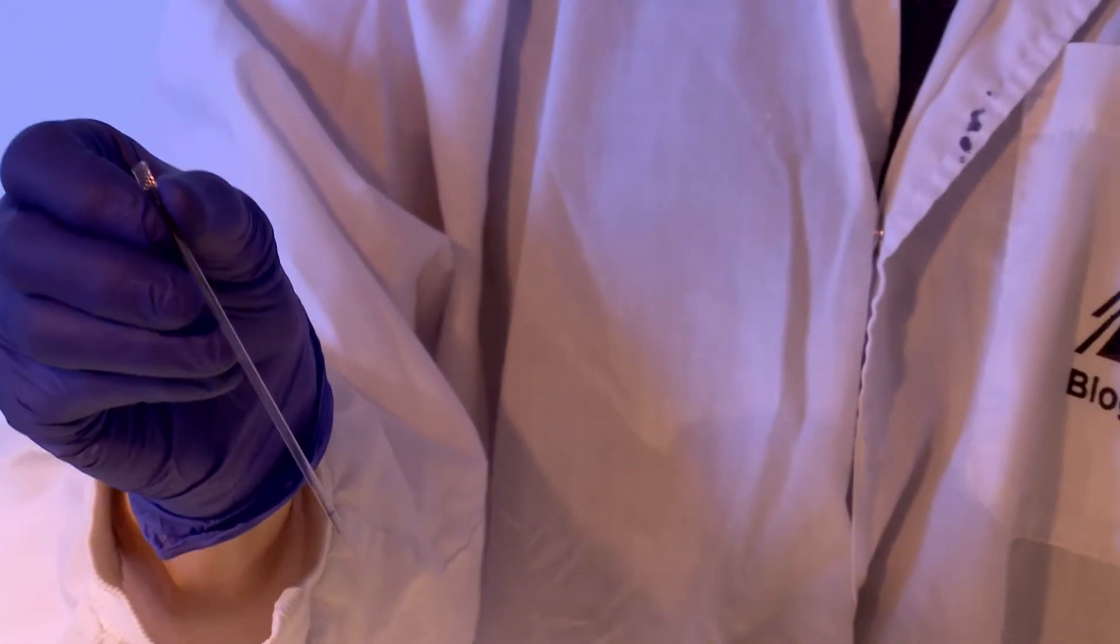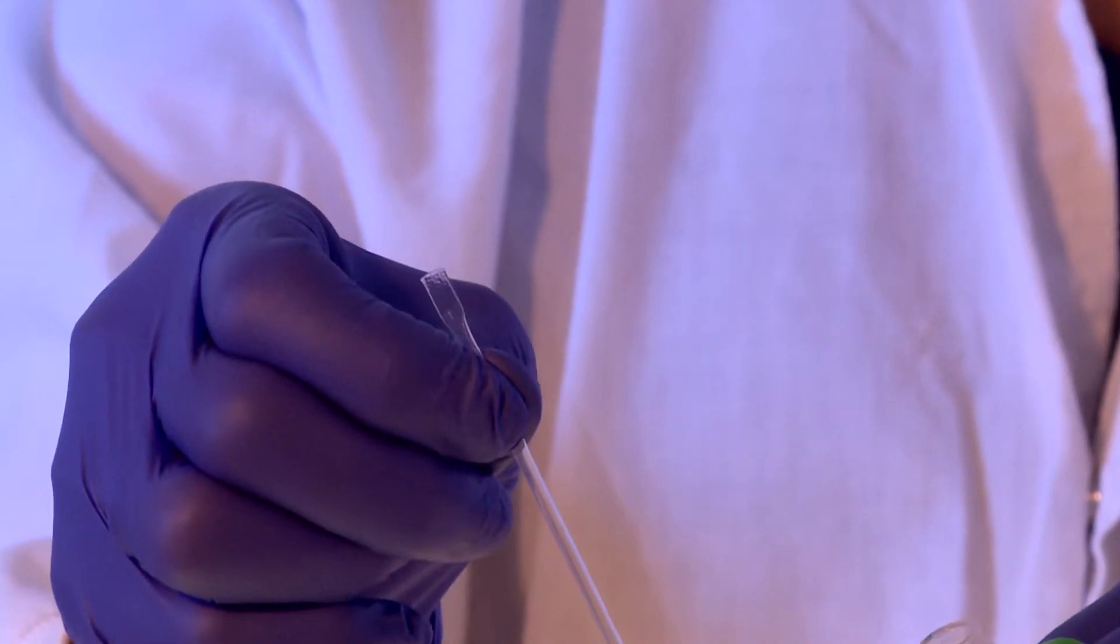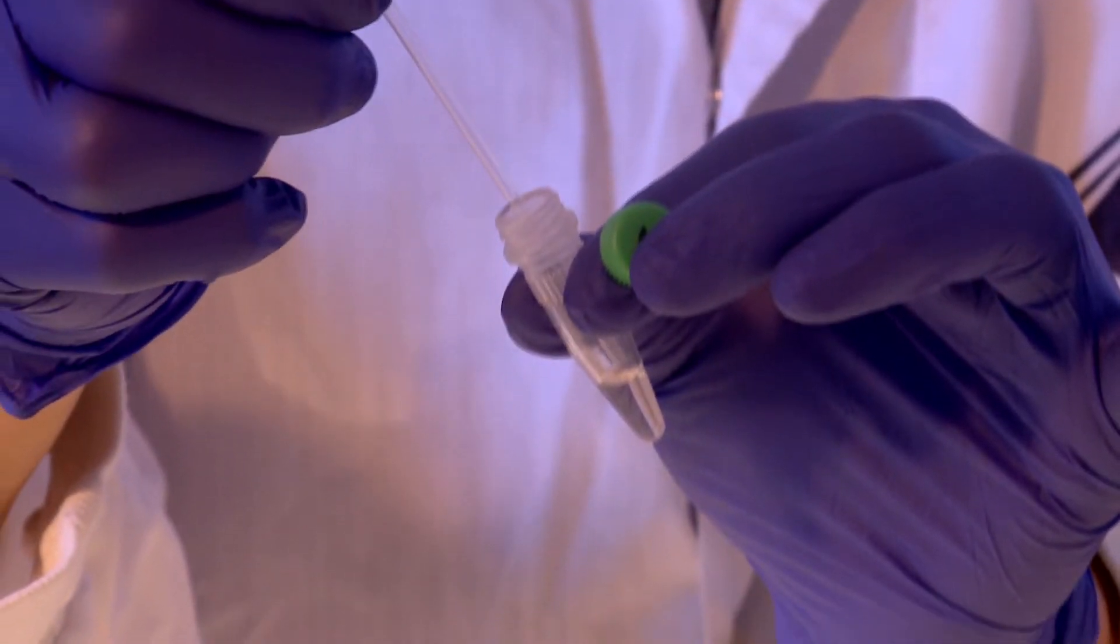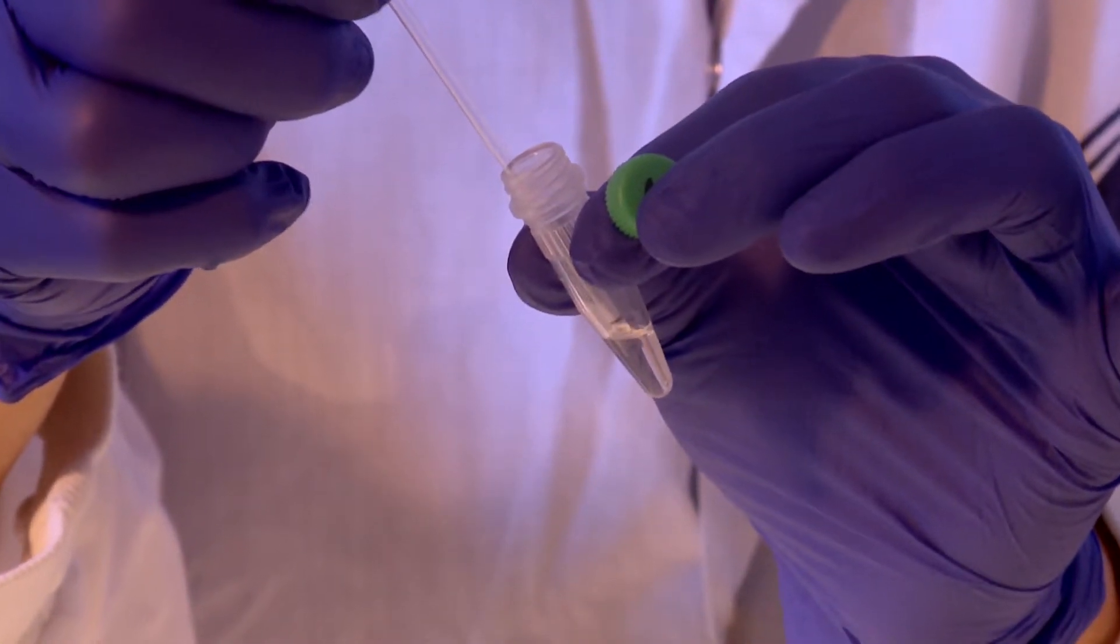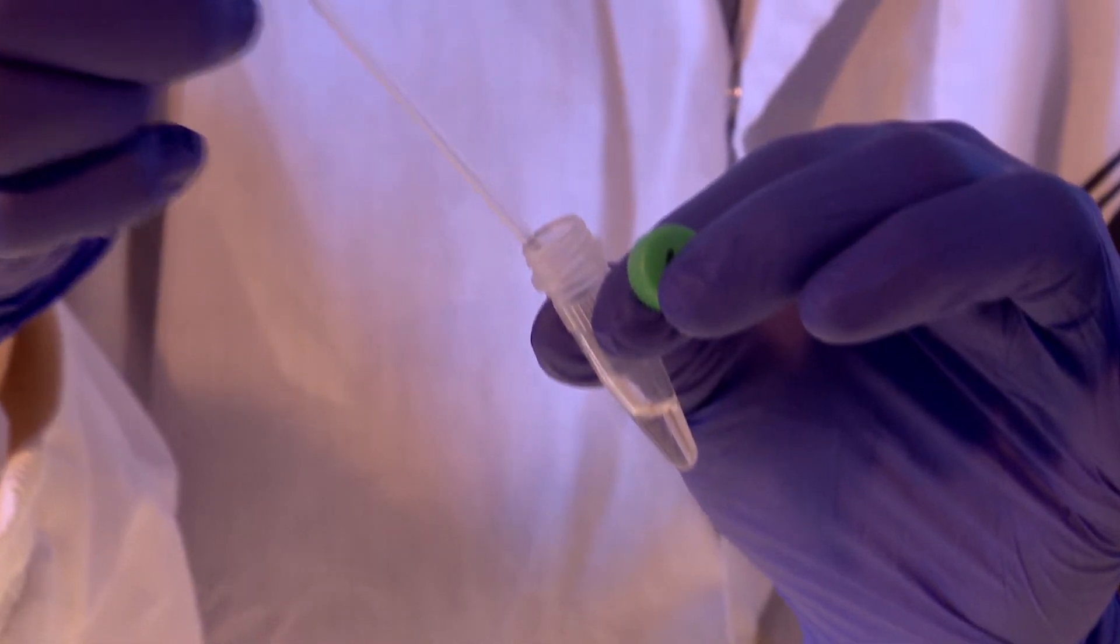This is performed by first depressing the capillary tube while outside of the DNA sample at a point distal to the black line tip, then placing the tip of the capillary tube into the DNA sample and releasing the pressure until liquid is drawn up to the level of the black line.